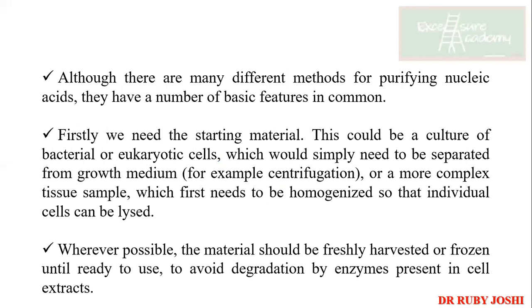Depending on that, you are going to have different methods of cell lysis. Okay, so let me just finish this cell lysis and then I'm going to ask certain questions which have already been asked in the exams, and maybe you can also ask me questions. So first you need to have the starting material.